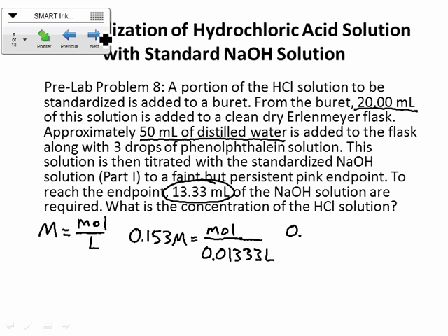That's going to give us 0.00204 moles of the NaOH that was added, okay?